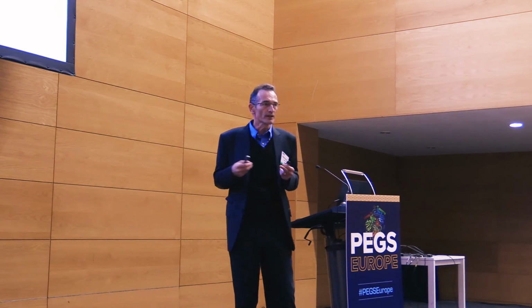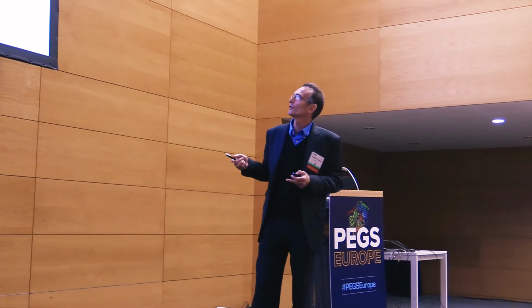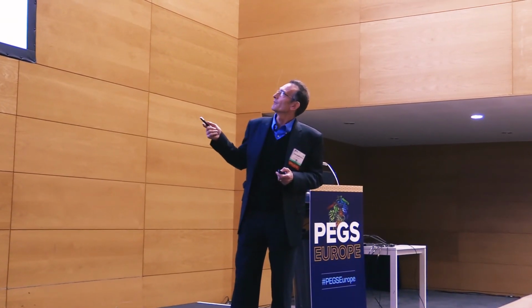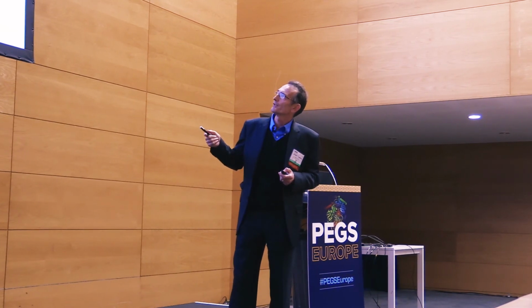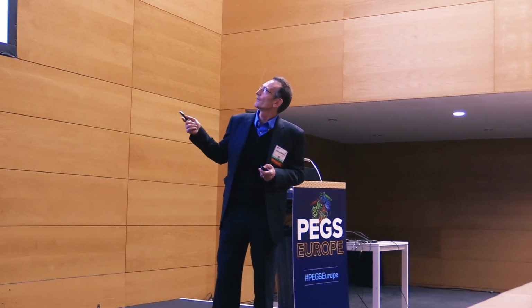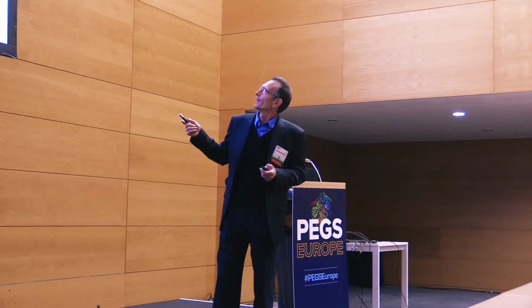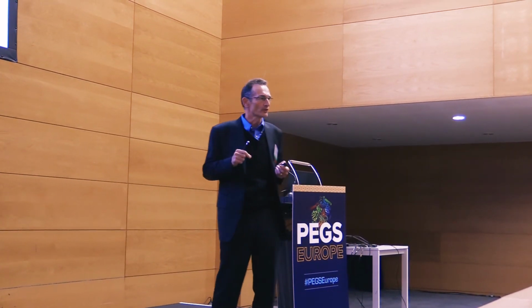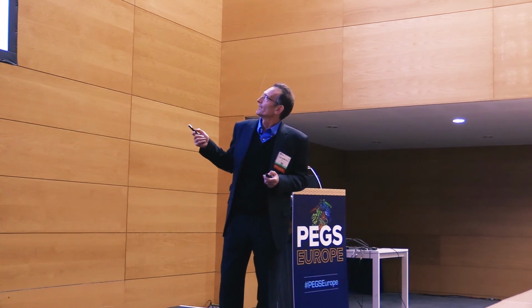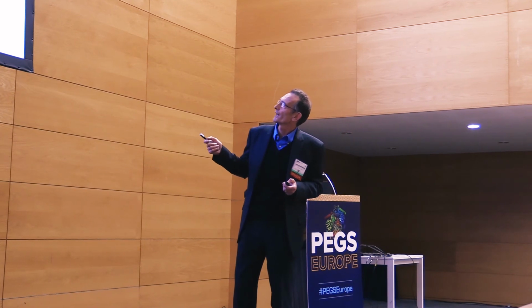So if you now look at these antibodies, and this is now looking for freeze-thaw cycles, so we have 10 freeze-thaw cycles here. The parental is in blue, and the light blue at 0, and dark blue after 10 cycles. And you can see that essentially the parental is overlapped. There's no difference. If you look at sirukumab, it has a very aberrant degradation peak. It also has a broad distribution, probably indicating the presence of aggregates. And finally, you've also got aggregates here.